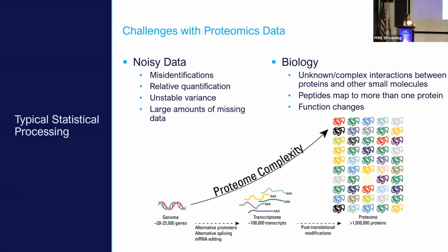With proteomics, we have rather noisy data, especially in comparison with metabolomics or lipidomics. In all cases, what we're getting and what we're talking about is relative quantification. And this is all for proteomics from that bottom-up approach and global proteomics. So we're not doing targeted analyses. We're just trying to see in general what all is there.